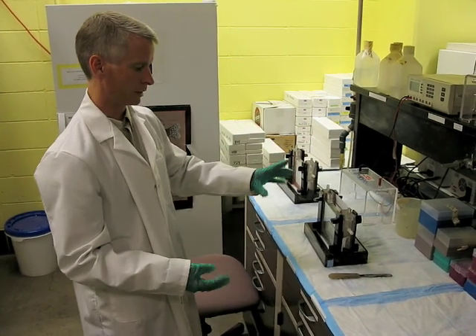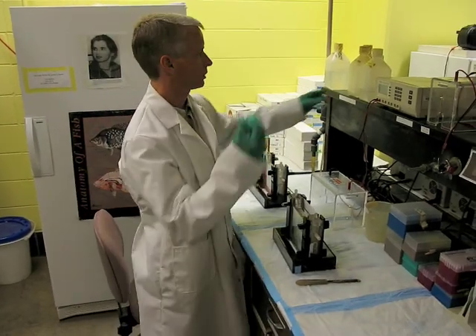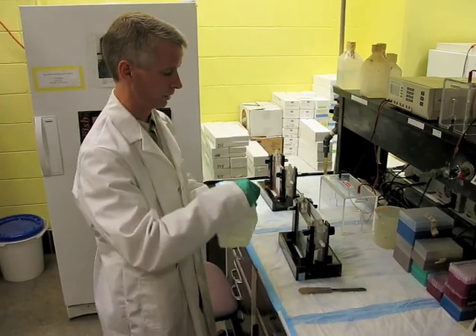The acrylamide material in the gel itself acts sort of like a sieve. Electricity is just pulling, and the smaller the DNA fragment, the faster it can sieve its way down through the gel material.